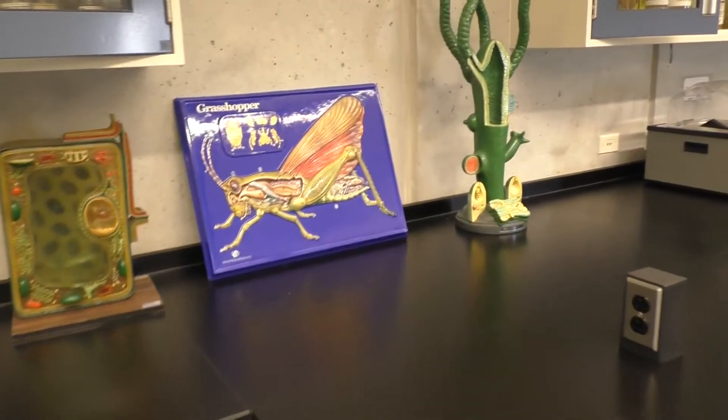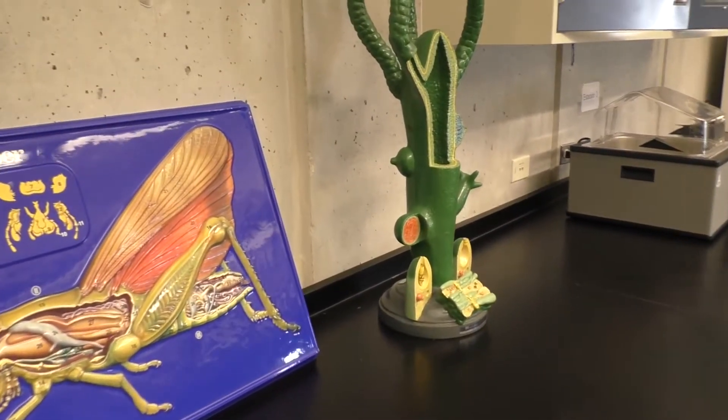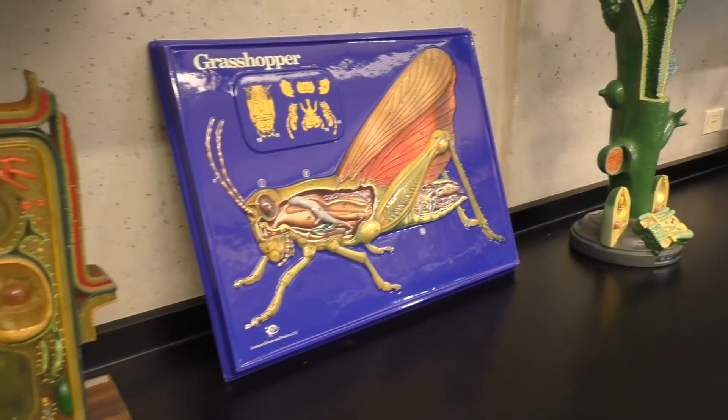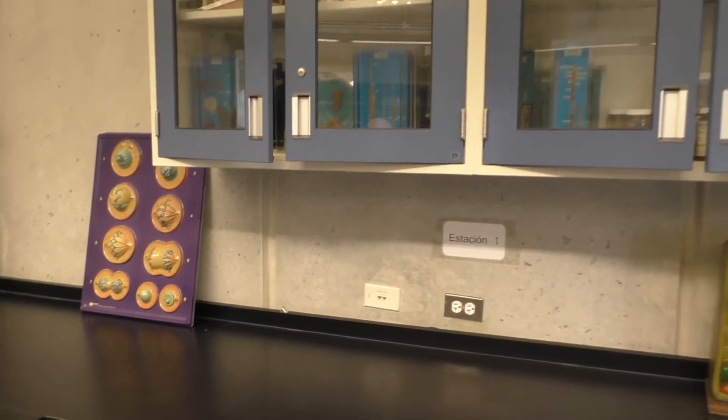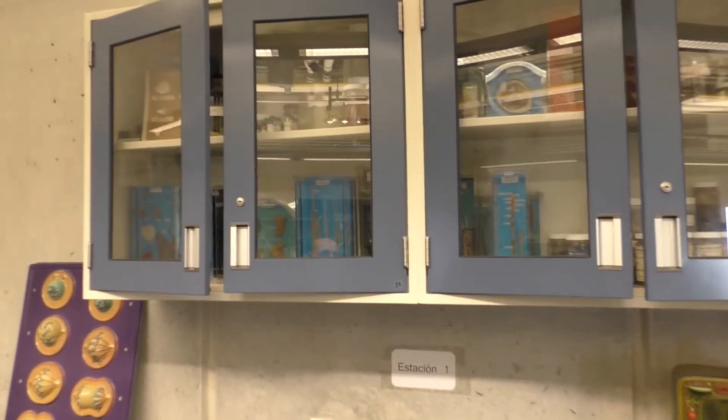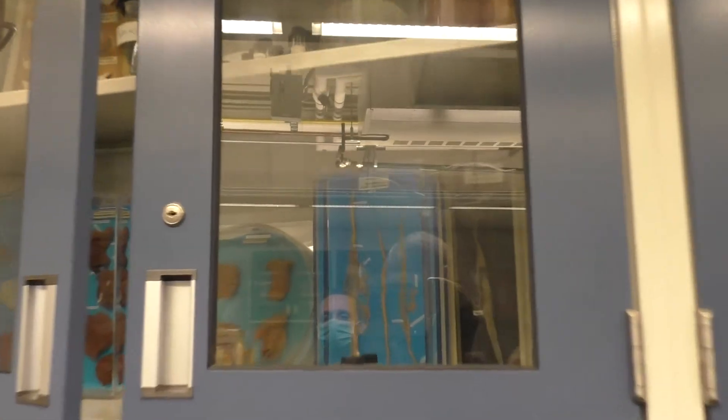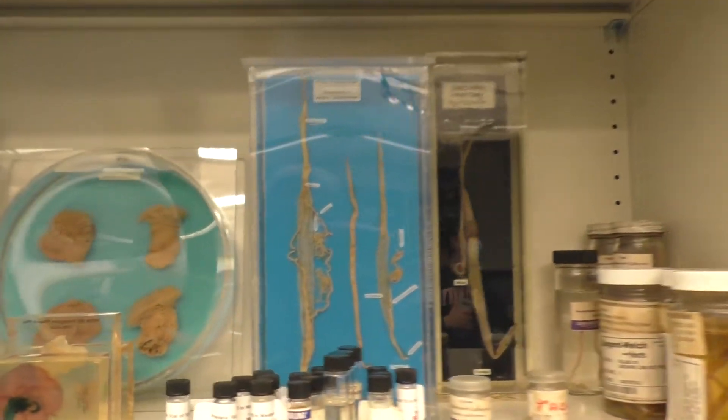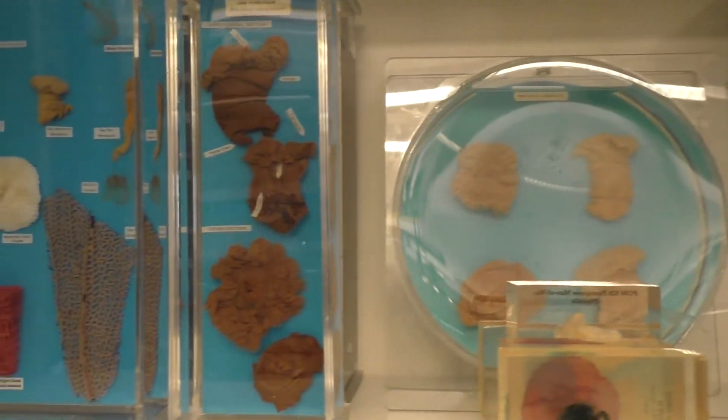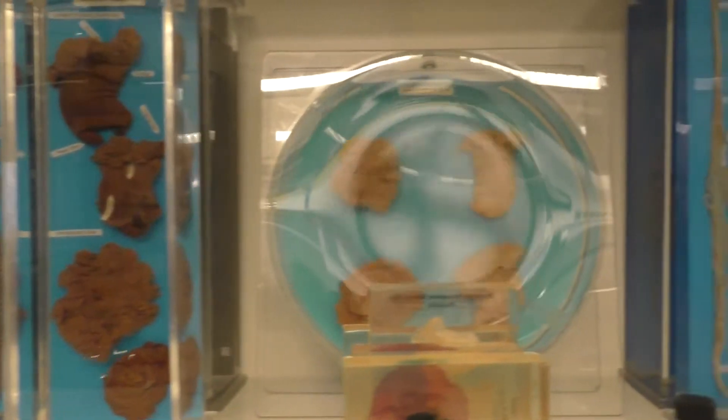There are also cell and animal models. And more preserved specimens, in this case invertebrates.